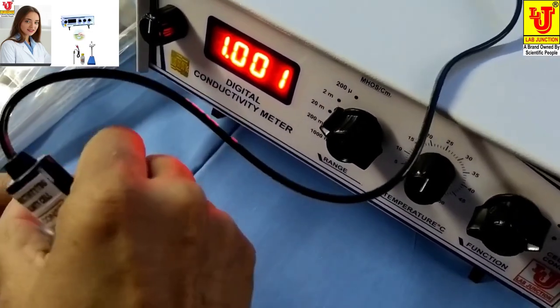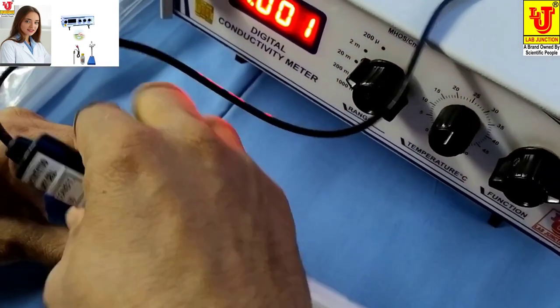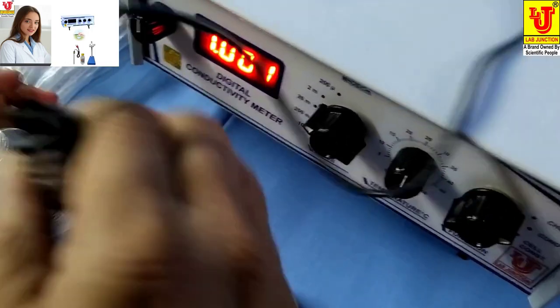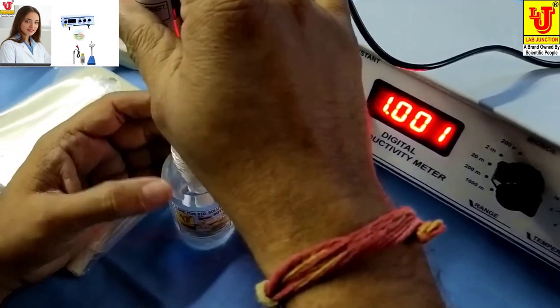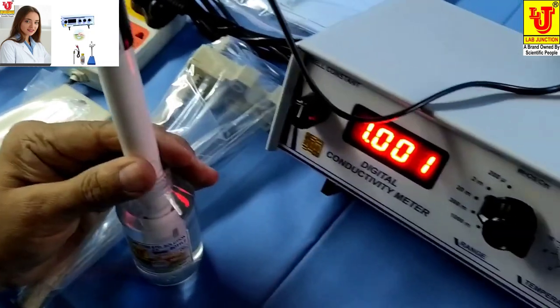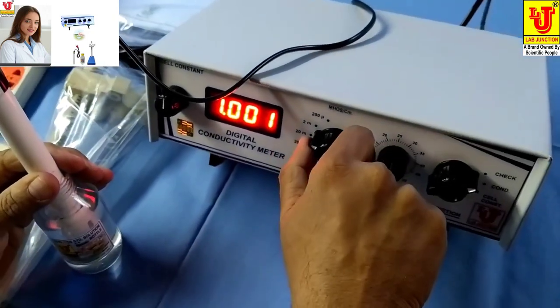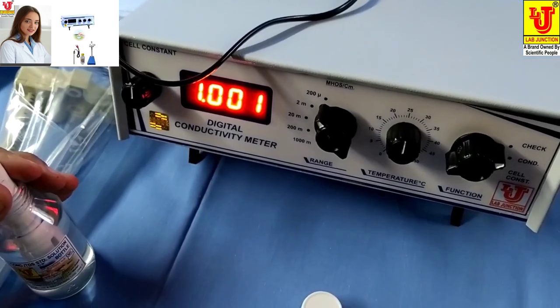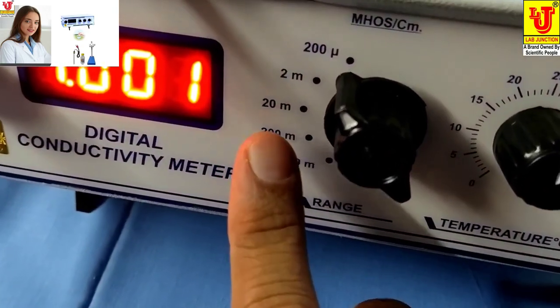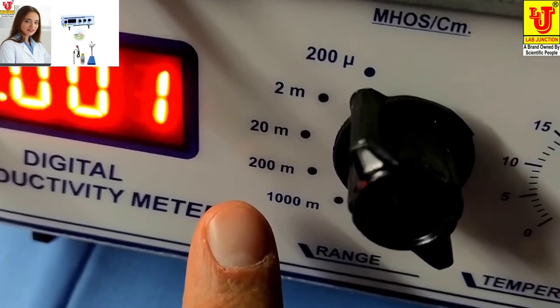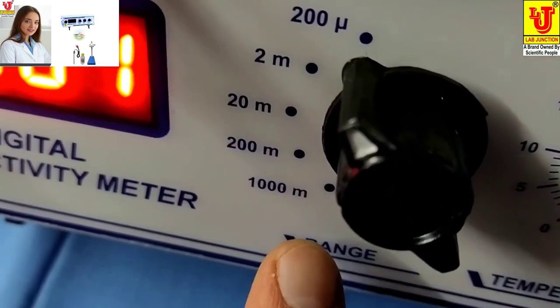This is our Conductivity Solution. You can dip in that. You can set first range 200 Microsiemens, second is 2 Milli, third is 20 Milli, fourth is 200 Milli, fifth is 1000 Milli.